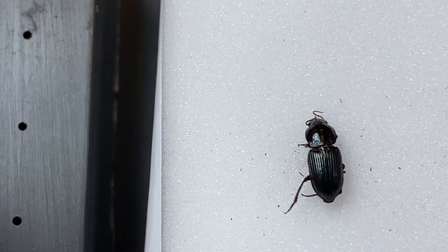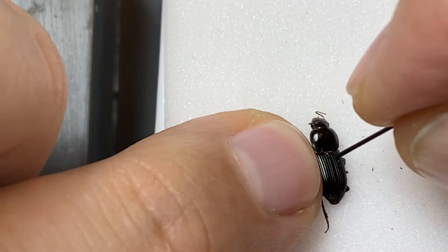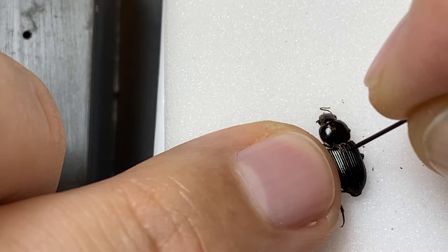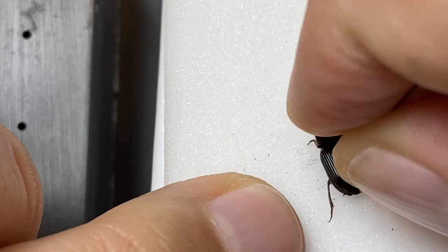If we zoom in on this beetle here, I'm going to take my pin and put it here on the right elytron, just right of center. I'm going to brace it with a finger from my other hand. I'm going to get into the top layer first — usually I do this in one quick motion. And now that I'm in, I'm going to adjust the pin so that it's perpendicular to the beetle, so it's going to go straight through the bottom. And now I've pushed it through the bottom.